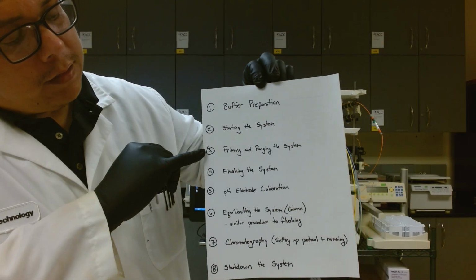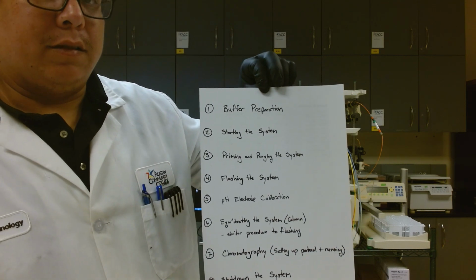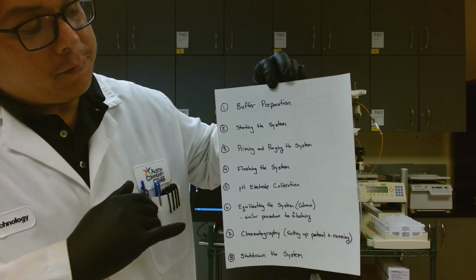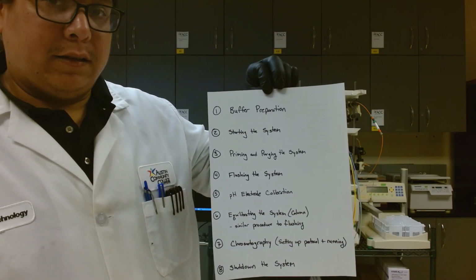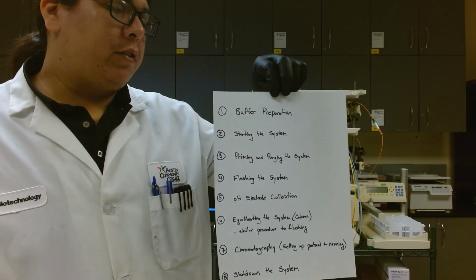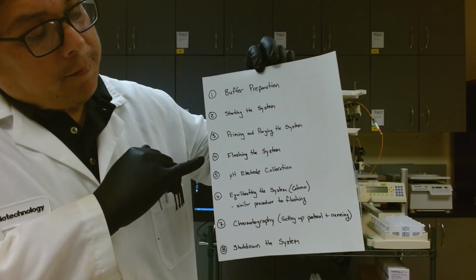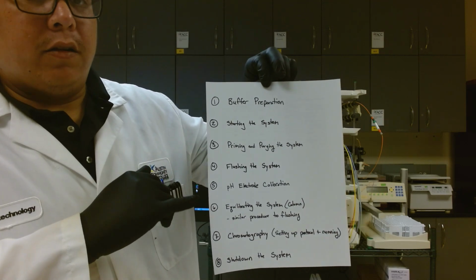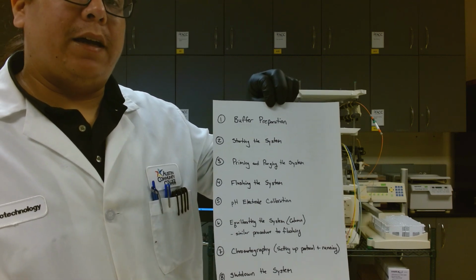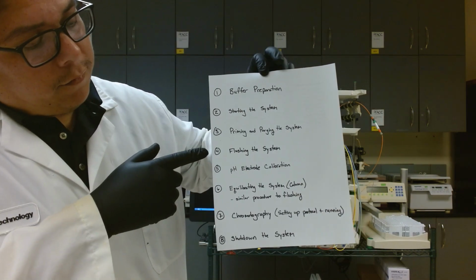And then once you've got the system started, we're going to show you how to prime and purge the system. So that will be how we introduce mobile phases into the system. Now currently the system is sitting in 20% ethanol. That's how we keep it for long-term storage. So I'll be rinsing out the 20% ethanol and flushing it with water. So the demonstration today is going to be with water, but these steps will apply to any mobile phase that you may use. So we're going to flush the system.